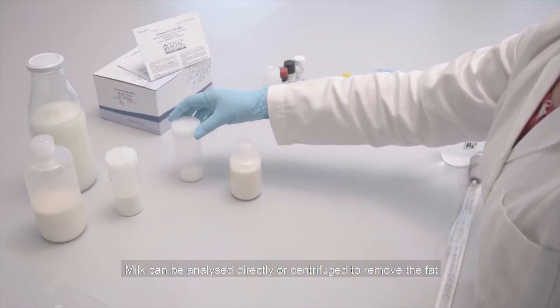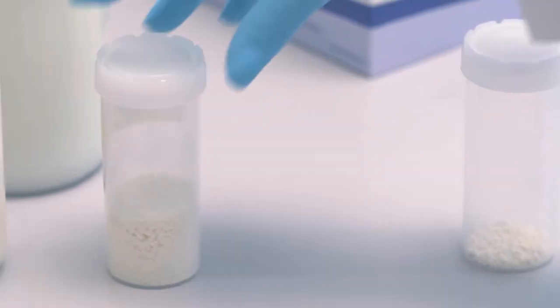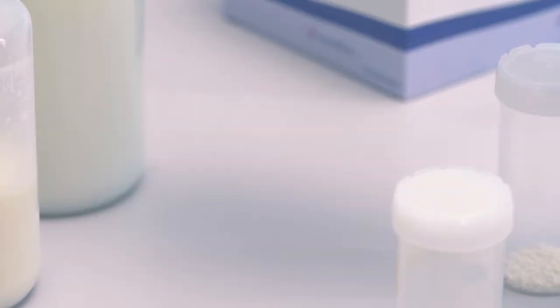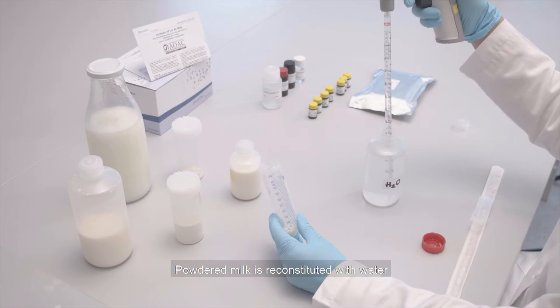Milk can be analyzed directly or centrifuged to remove the fat. Powdered milk is reconstituted with water.